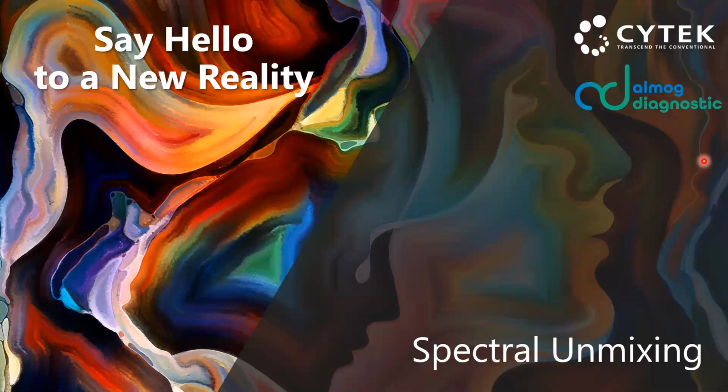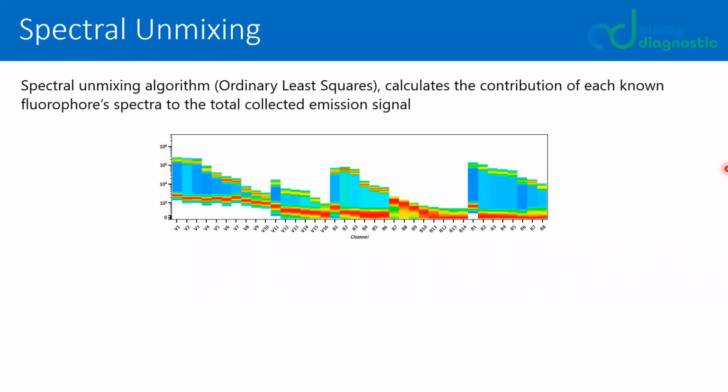So, hello everyone. Thank you, Nitzan. My name is Aviva, and I will talk about the scientific aspects of spectral flow cytometry. Now that we have talked about fluorochromes and how we can obtain unique signatures, let's talk about spectral unmixing and how it works for our system. Here, again, we are looking at the signatures to think about how the unmixing algorithm works. So how do we determine how much of each fluorophore is contributing to this signal? This is exactly what spectral unmixing is giving us.